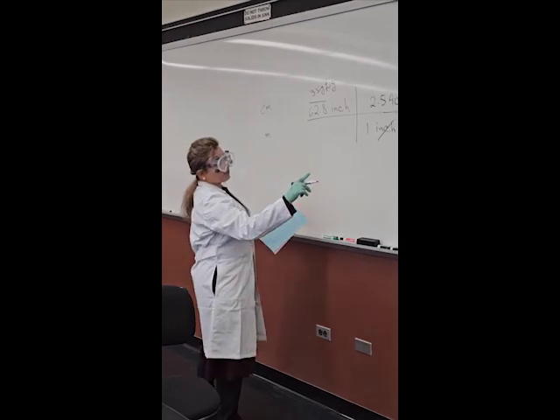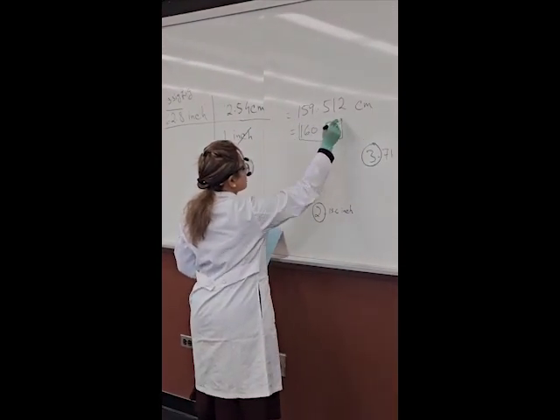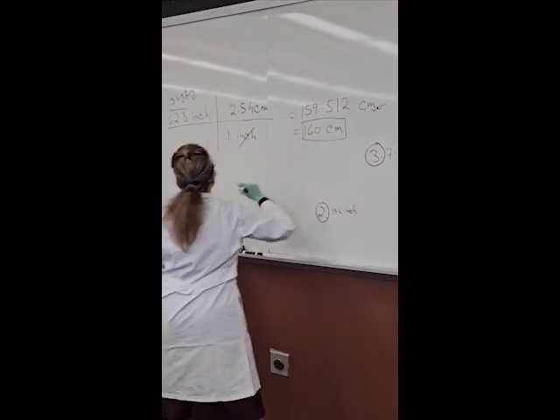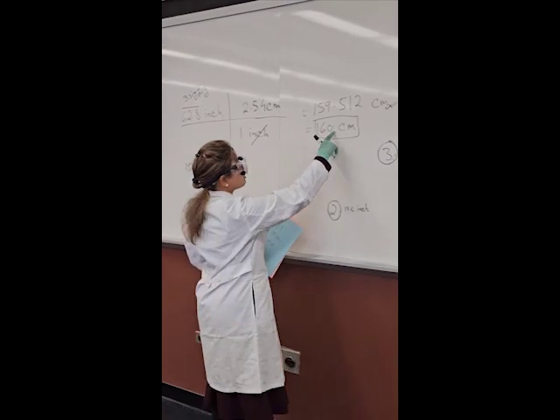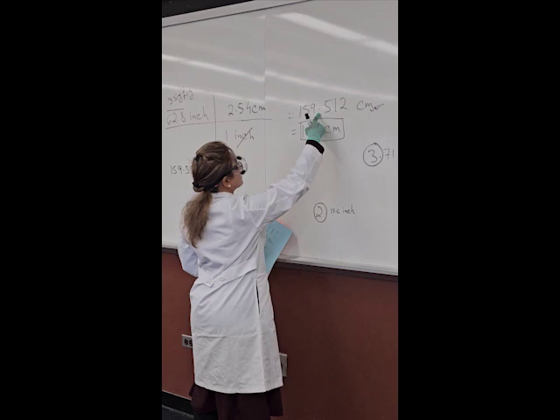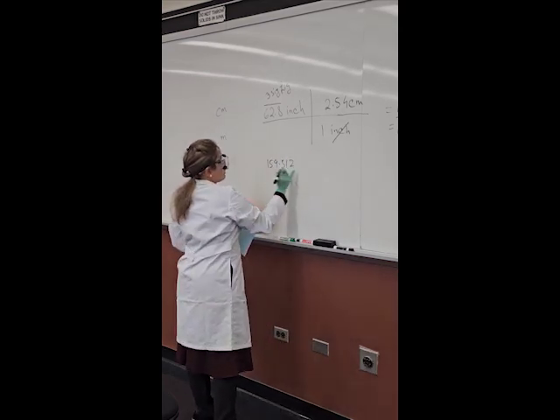The second one is, when I go to the second part, do not use this rounded number. You have to use this number, 159.512, because this is not the actual one, okay? This should be the actual one after doing all the measurement. This is the rounded amount because we want to get the basic figure. So 159.512.